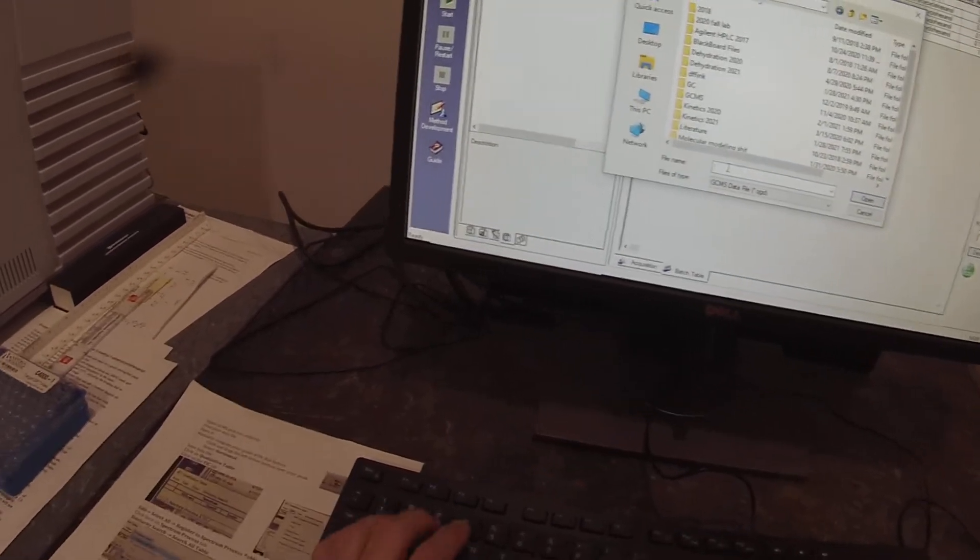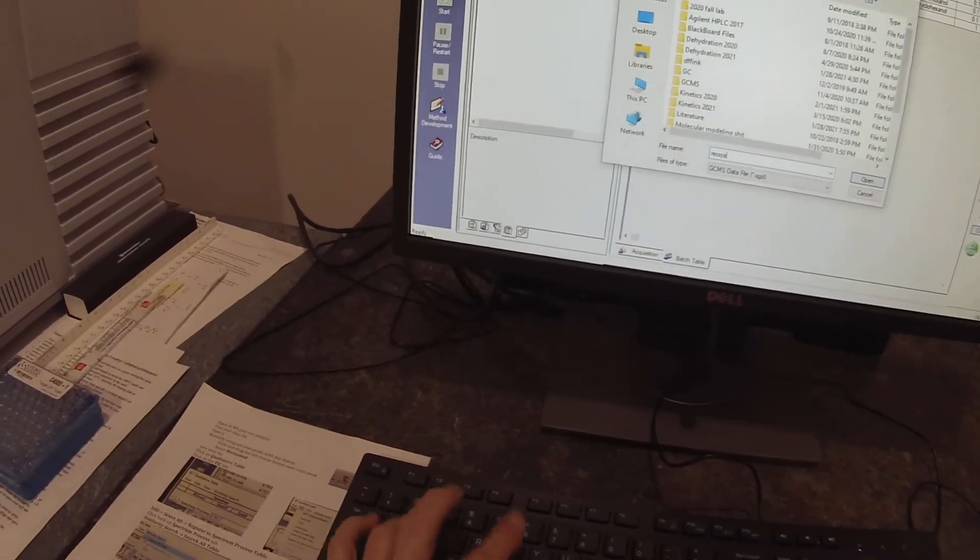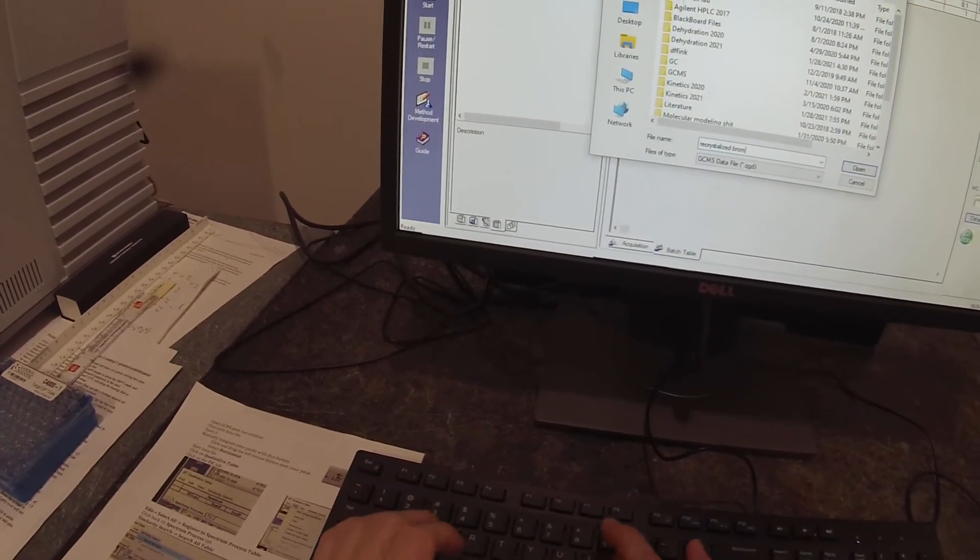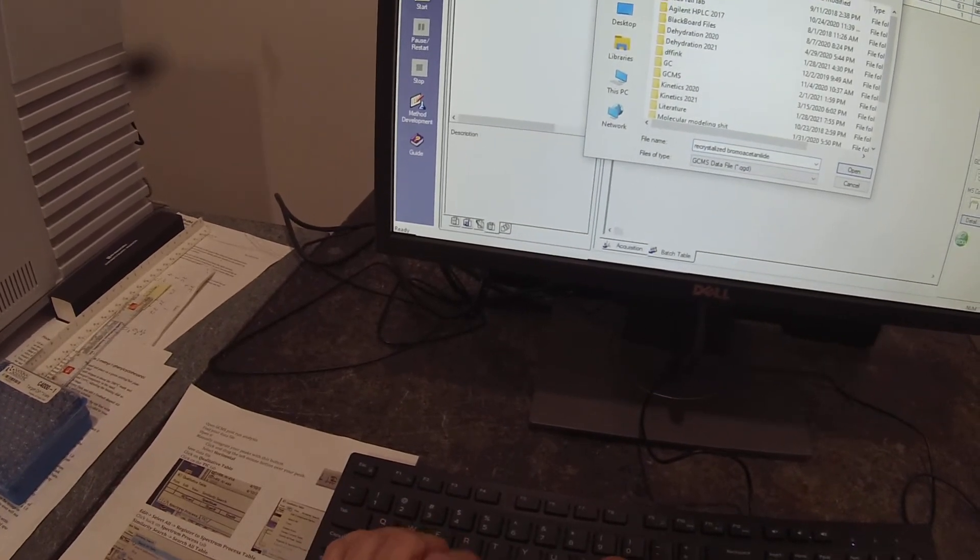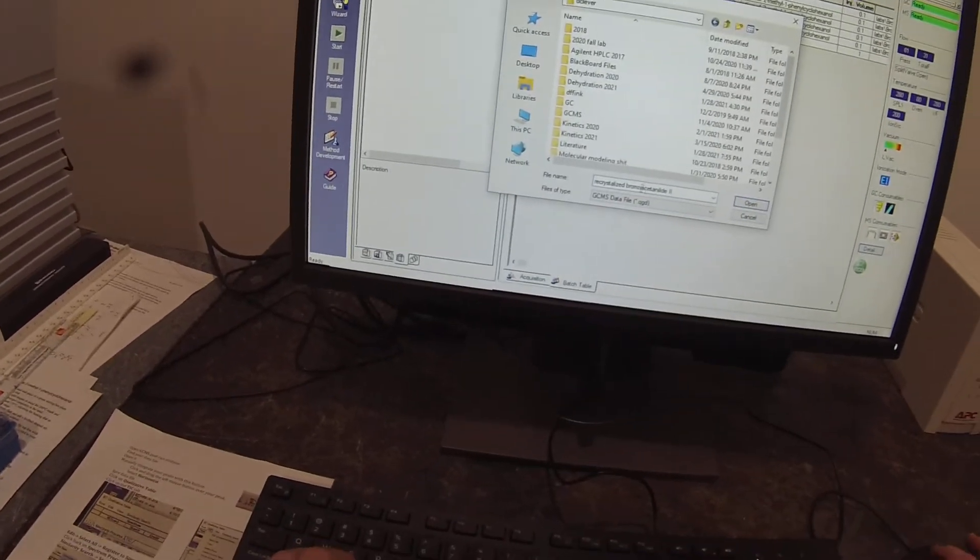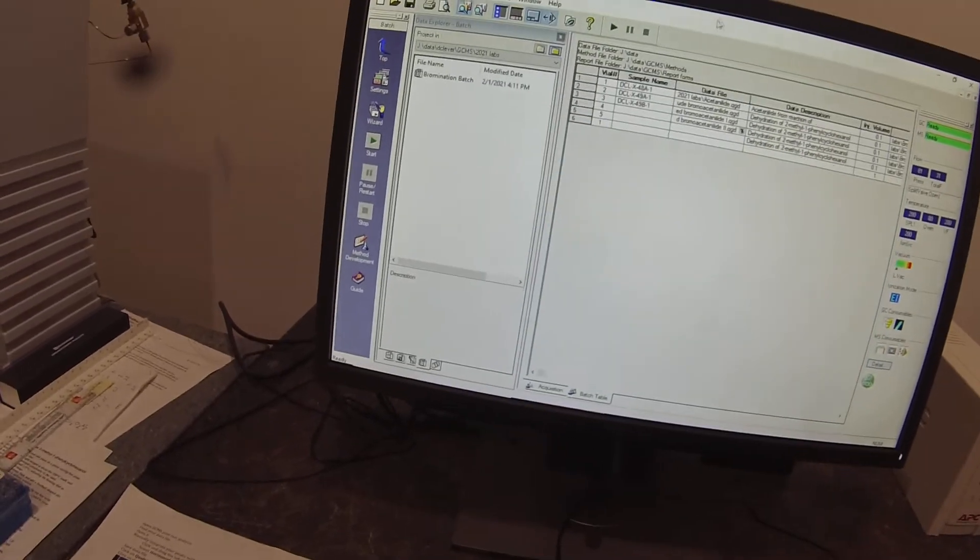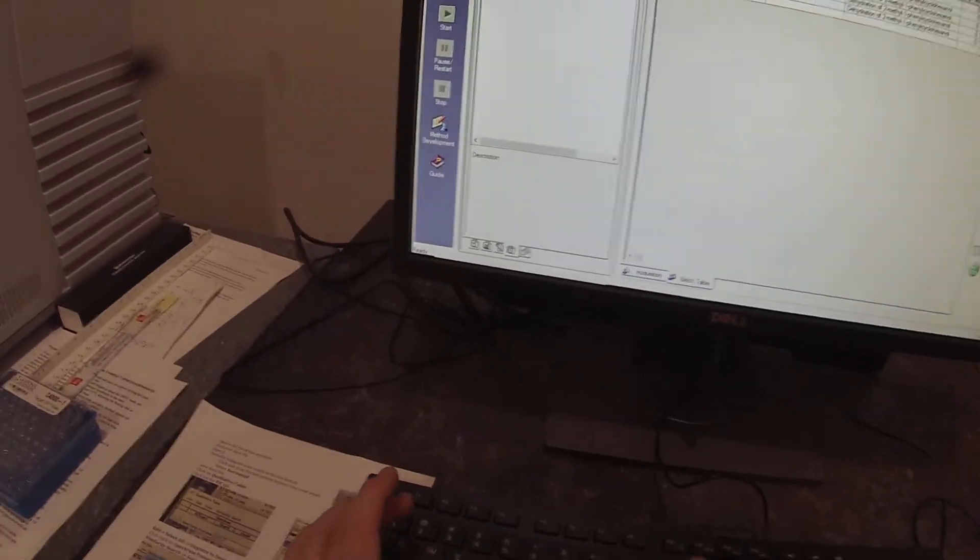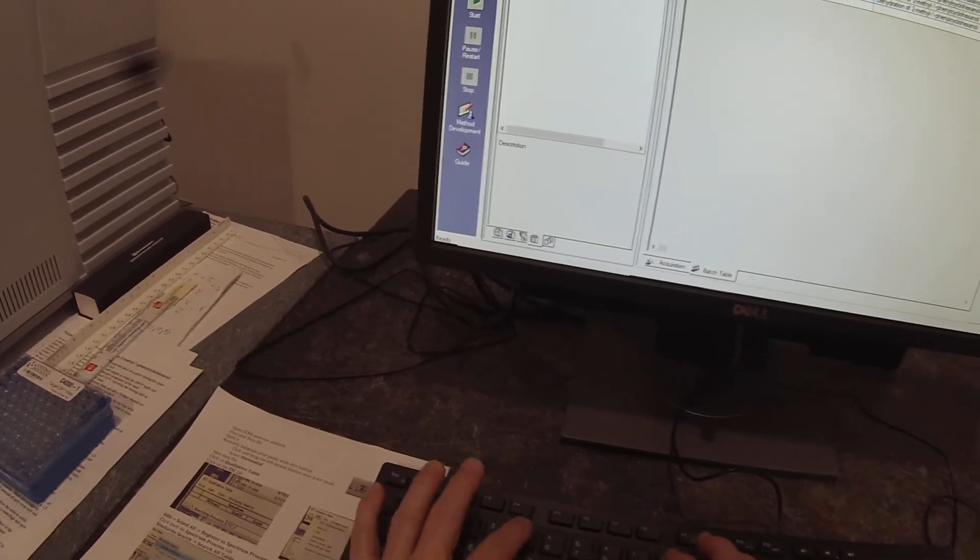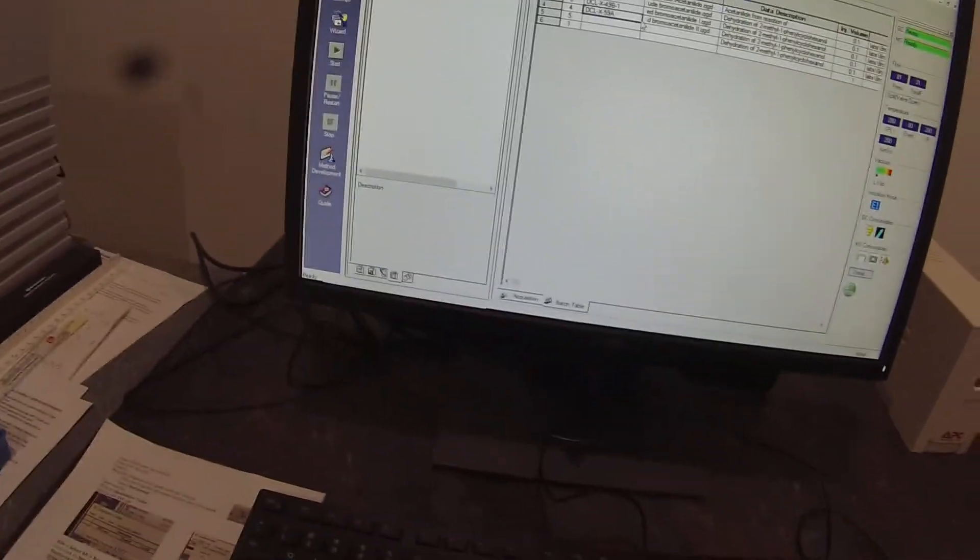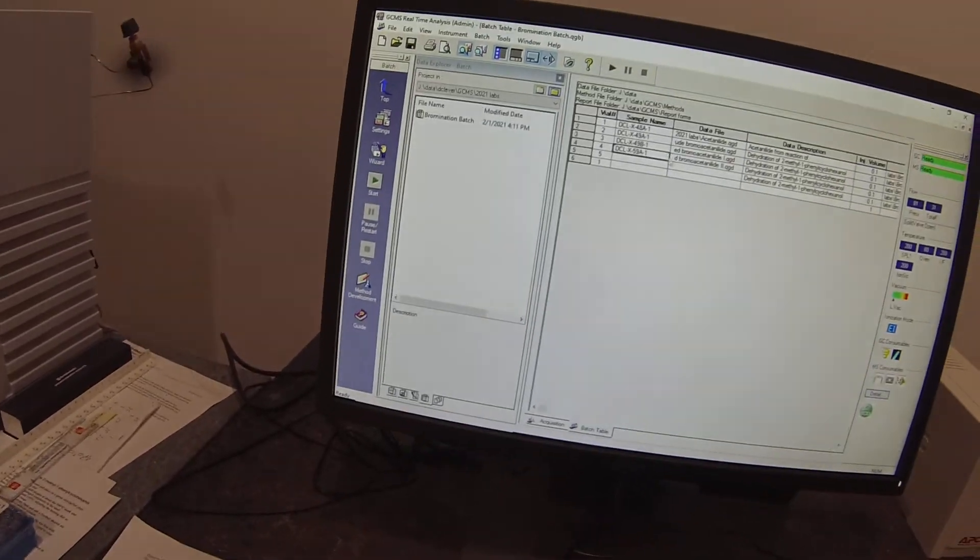So I'll put a number one on it. And for this other one, it's recrystallized batch two. And that was DCL dash 10 dash 59A minus one.